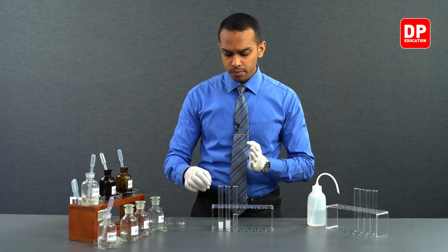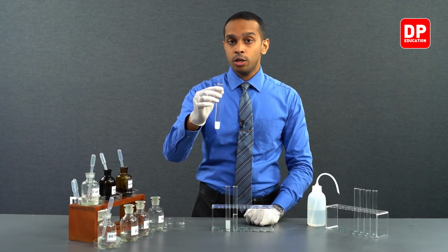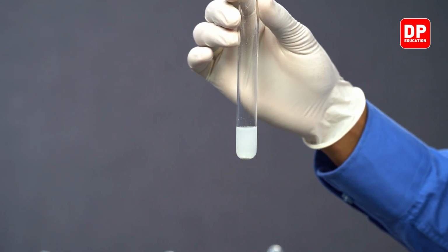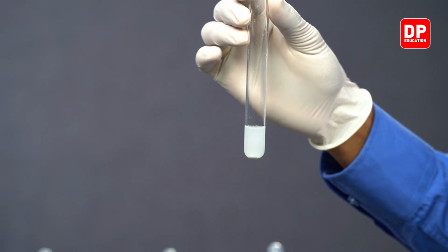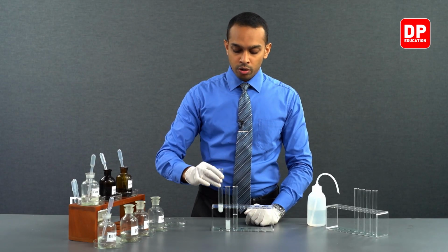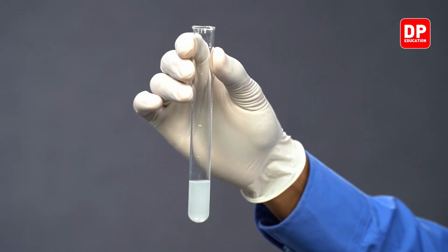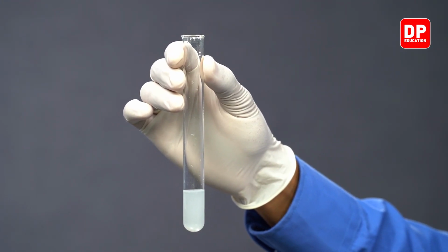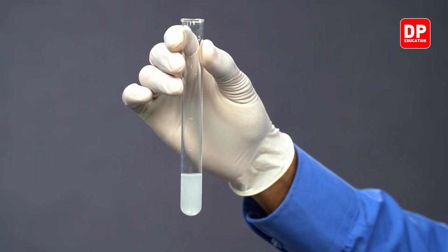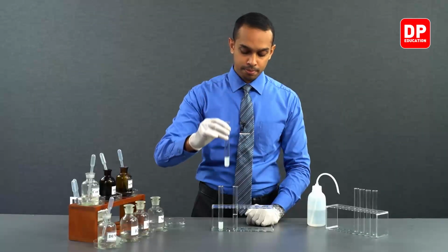When mixing bromide ions with silver ions, you will form a precipitate which is pale yellow in color, known as silver bromide, AgBr. It is pale yellow in color. We took a portion of that precipitate and reacted it with a little bit of dilute nitric acid, and we saw dilute nitric acid could not bring about any change, as dilute nitric acid is not dissolving silver bromide.